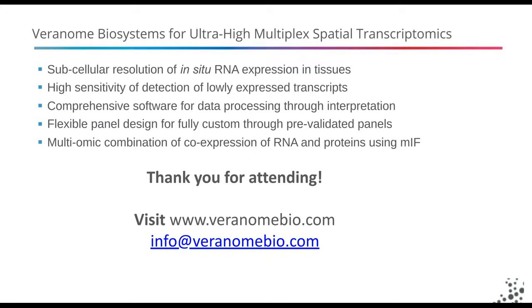In terms of the analysis, I'll let Brian handle that question. Yeah, the analysis time is really pretty rapid. I think within 15 to 20 minutes, you can probably get cluster visualization, t-SNE plots, looking at cell by gene matrix numbers, and doing a lot of visual inspection of molecular maps and that sort of thing, and looking at correlation data, very, very quickly. Offline, you could then download the data into other statistical analysis packages and do whatever you would like. So you're getting to data very quickly on the system with the tools that we've already built in.